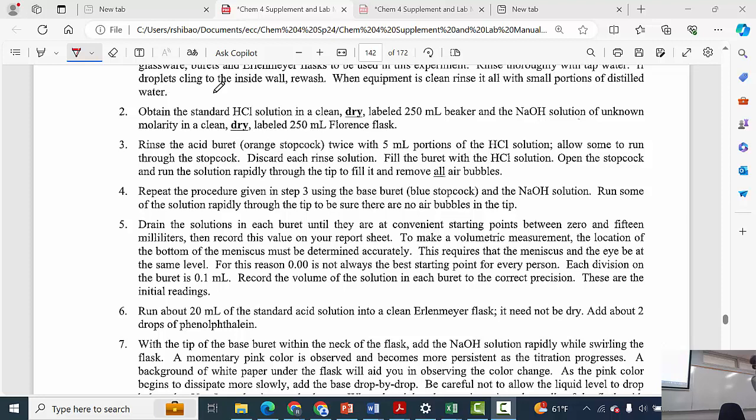There's a big bubble in here. Sometimes you could do it vertically. I do it vertically. This bubble's not coming out. Oh, maybe there it goes. Sometimes you could shake it and the bubble will go up. Or sometimes, if it's really stubborn, just hold it horizontally. This bubble is really stubborn, so I'm going to hold it horizontally and then shake it back and forth. Okay, there it went. 3 bubbles just left. There. And now I'm between 3 and 4 milliliters.